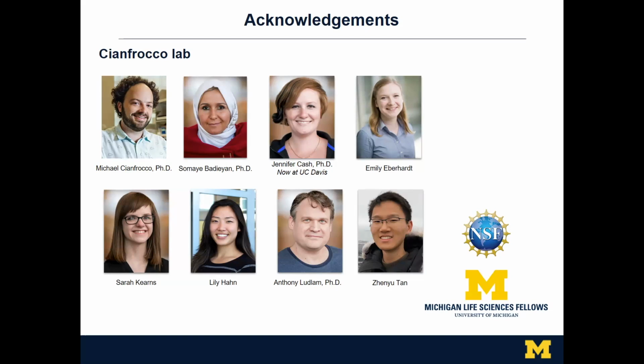Great, thanks, Yilai. That was great. We got a couple of questions in the chat already, but if anyone else has any more questions, feel free to submit them and we'll read them out. First up, have you compared the final resolution or map quality with and without the bad micrographs classified by MicAssess for that P-Rex data set? If so, what did you find? Was there any difference if you excluded the bad micrographs?